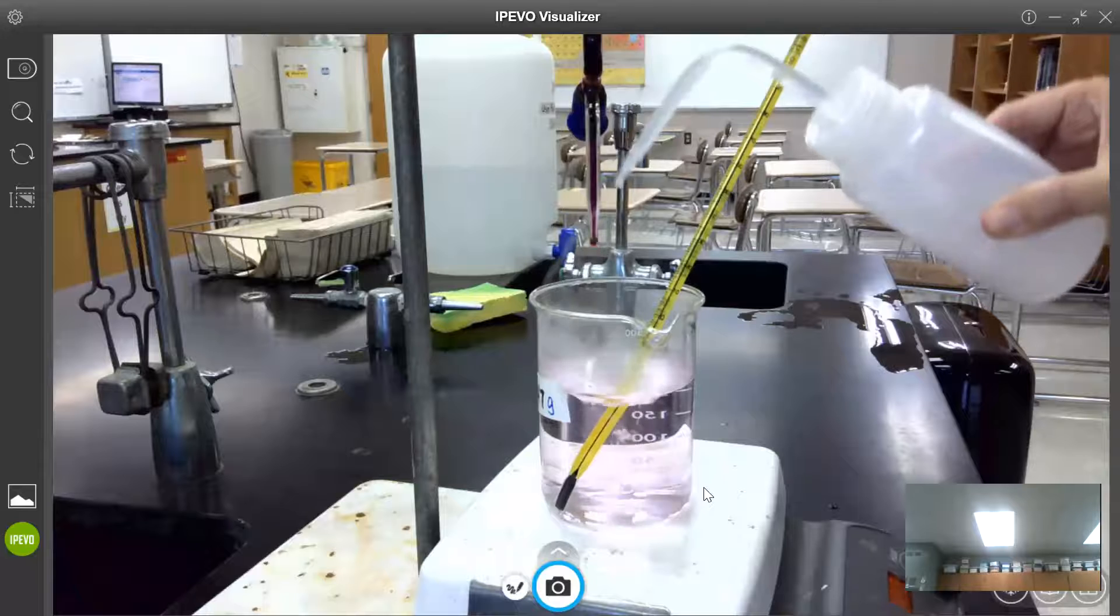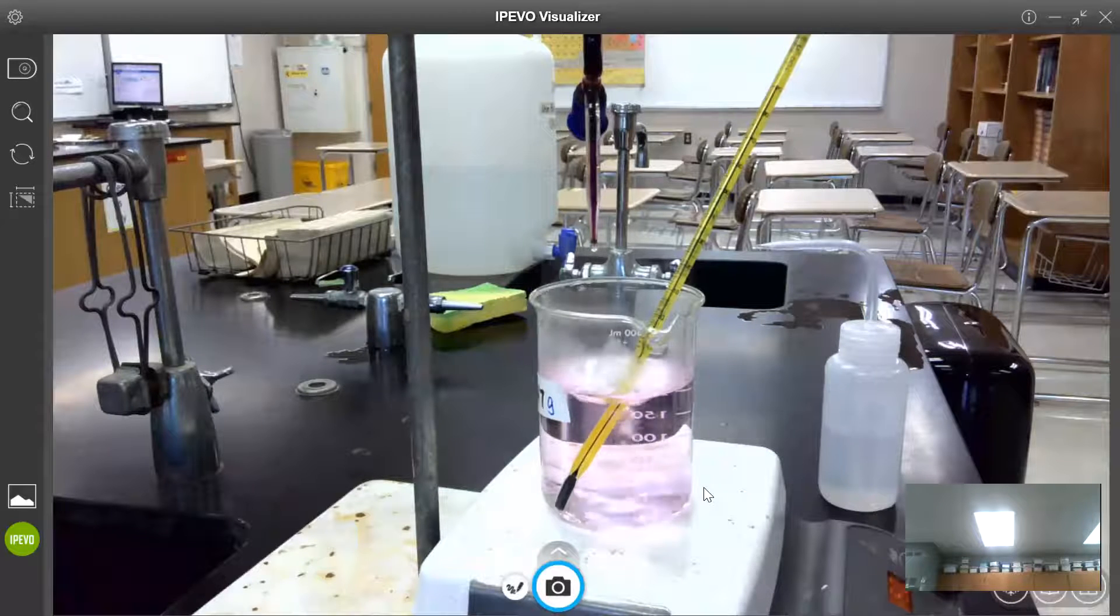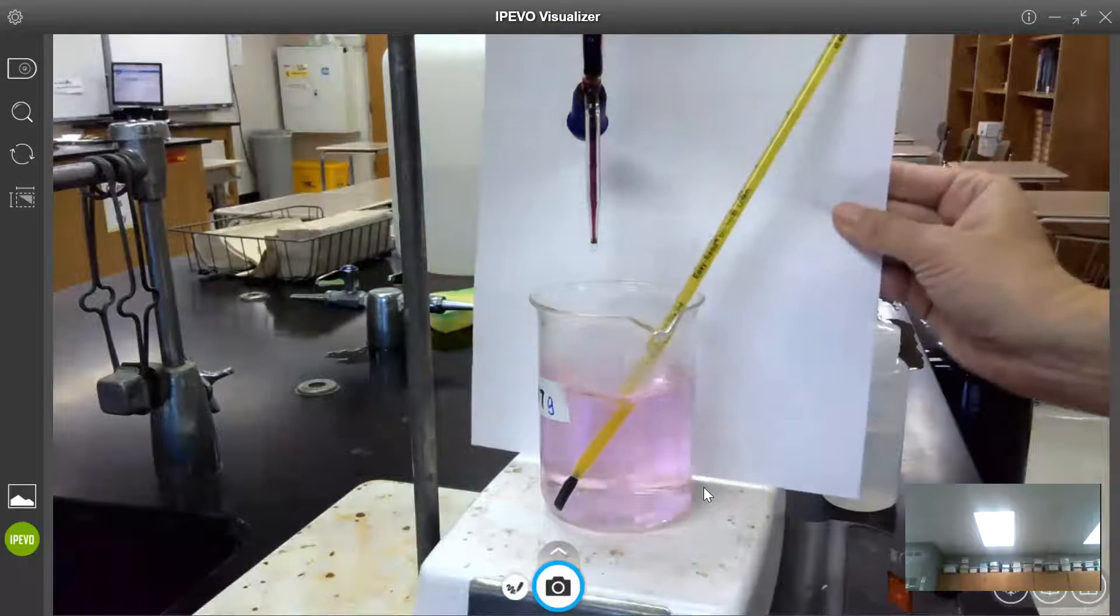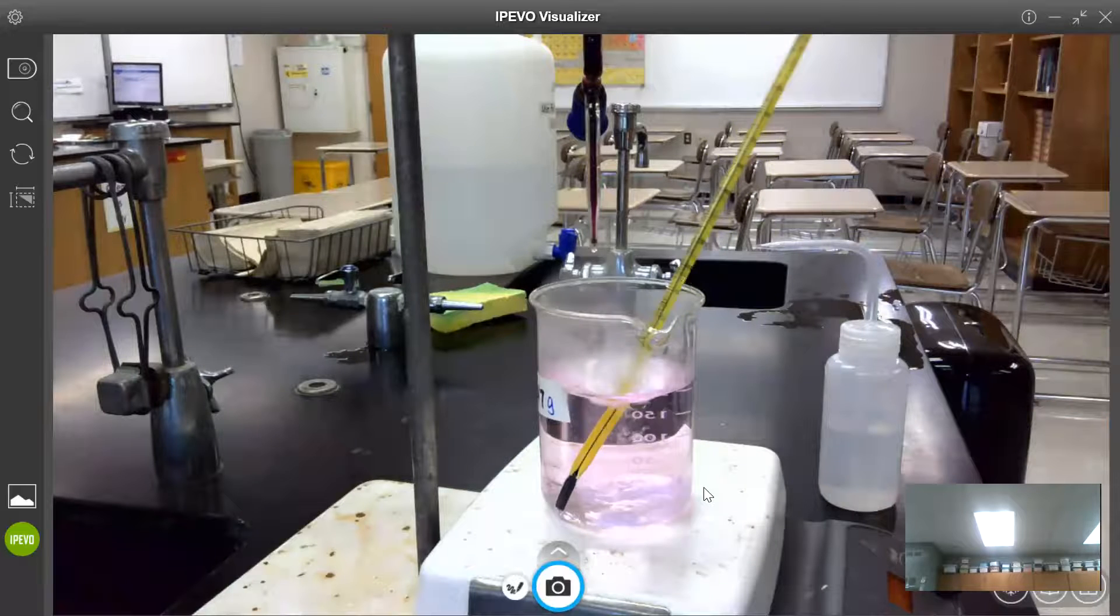And you can see we've achieved a pale pink color. I'm going to put a white background behind it so you can see that. And so that pale pink color tells me that I've reached the end point of my titration.